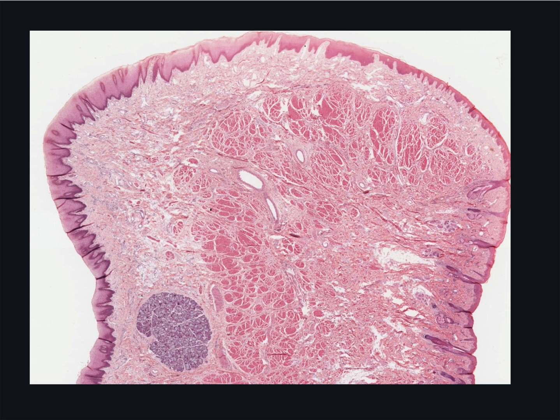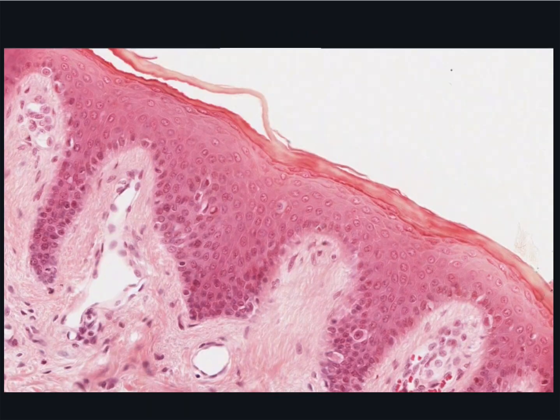The mucosa of the vermilion area of the lip has no hair follicles or glands. The dermal papillae are long and extend far up into the epithelium. They would normally contain a particularly large number of blood vessels, which impart the red colour to our lips. The thinness of epithelium over them maximises their effect. The epithelium over the vermilion border is very lightly keratinized.